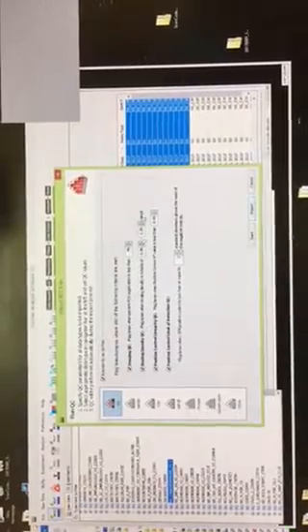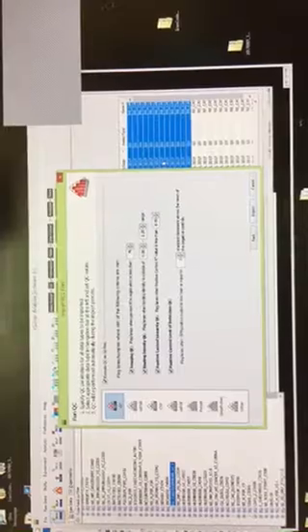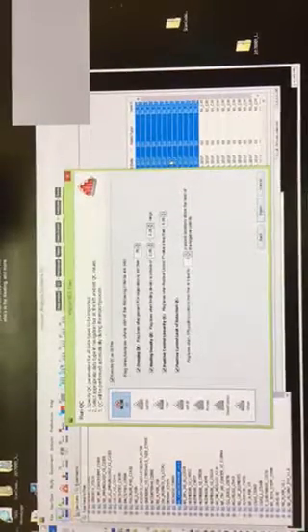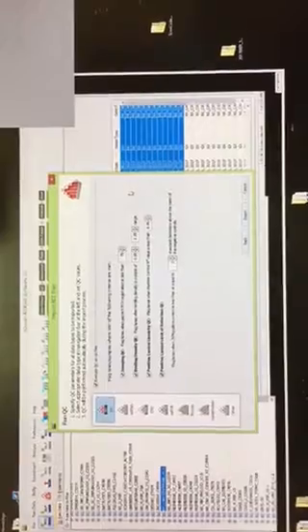It's also looking at the binding density, and this can be a bit confusing to customers. Binding density is basically the number of fluorescent spots per square micron on the cartridge. Sometimes customers will get a high binding density flag. I say, as long as there's no imaging flag, your data's fine. If binding density gets too high, you may lose imaging quality, but if your imaging is good, then there's nothing really to worry about there.